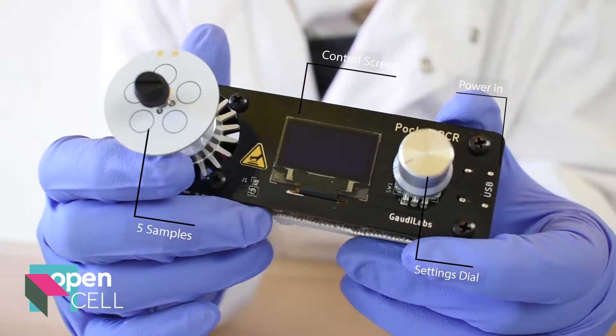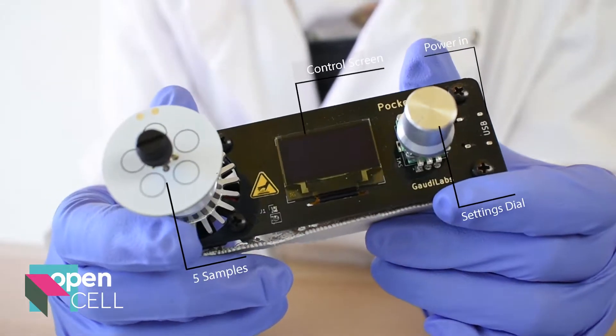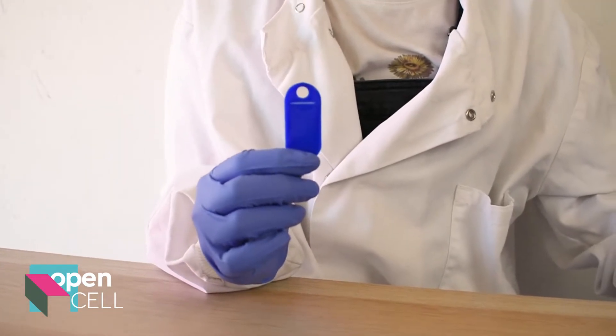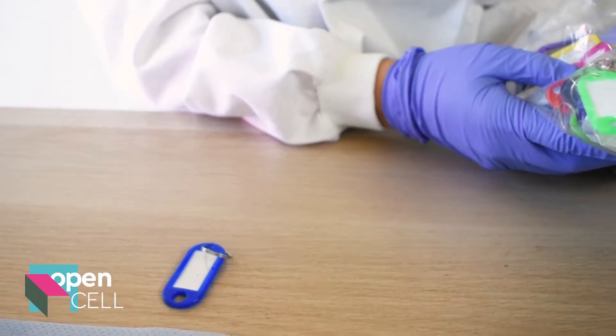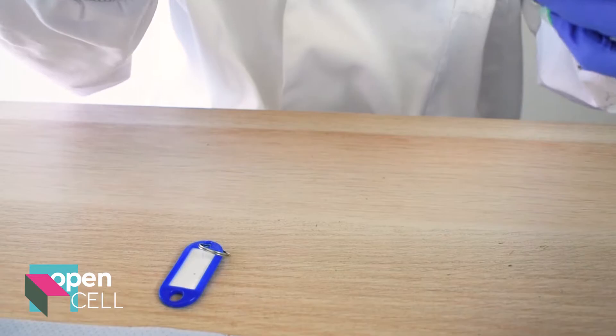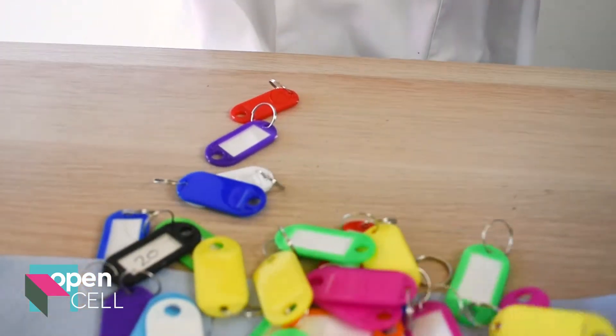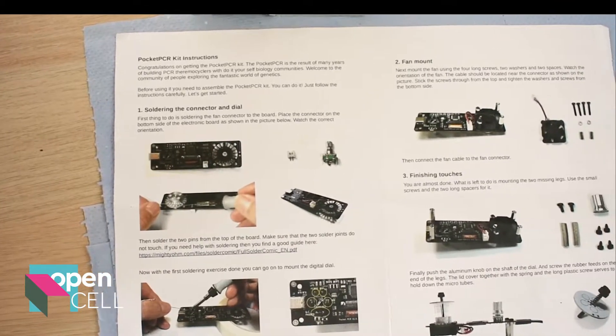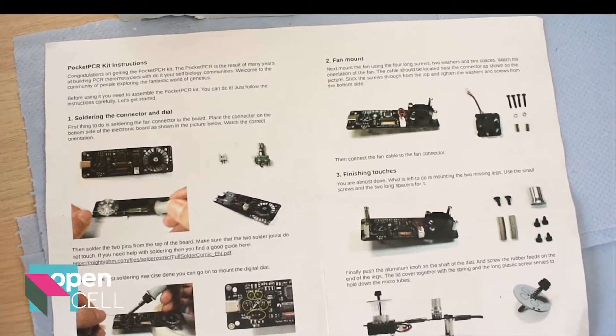At a petite 10 centimeters long, this thermal cycler is capable of everything a standard PCR machine can do, taking just a few fragments of DNA and amplifying it to make thousands of copies of your desired length. It comes as an easy to assemble kit, so I'm sure Tom here at Open Cell had a lot of fun putting this machine together.